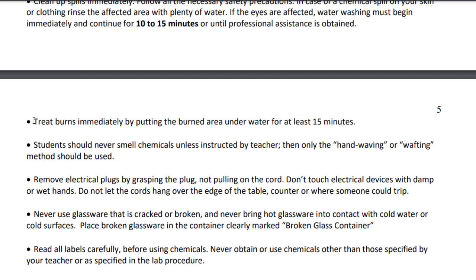The same thing goes for treating any kind of a burn that you might have. You want to put that area underwater as well. And you want to do that because it's going to prevent the burn from being as bad as it could possibly be. You're going to cool down the skin right away, and it's going to prevent you from having skin peeling and all sorts of stuff, depending how bad the burn is. Even if you're just at home and you burnt yourself on a hot pot or something like that, you want to make sure that you're cooling it down for about 15 minutes to help treat that burn.